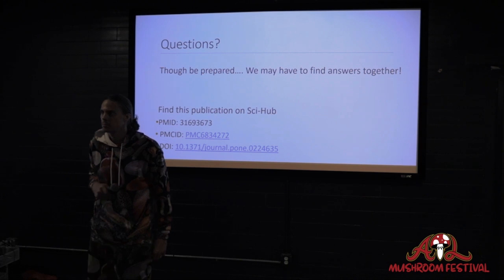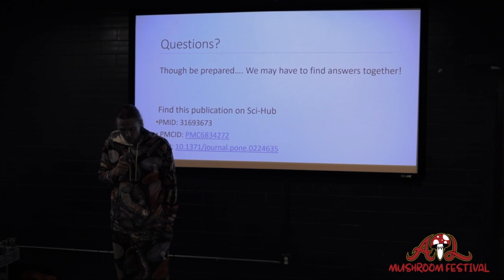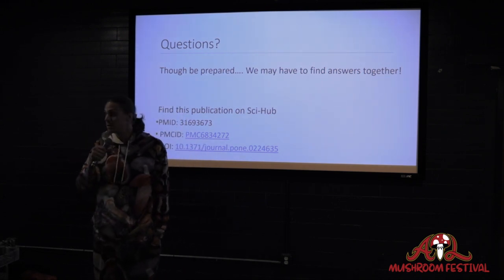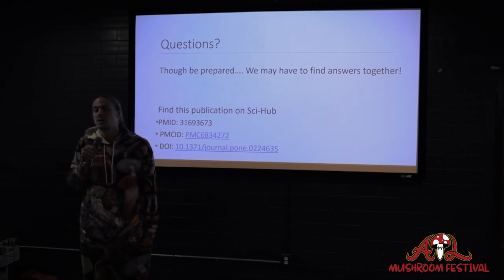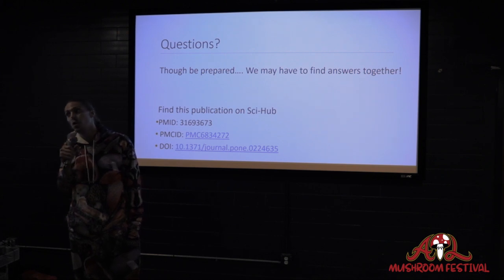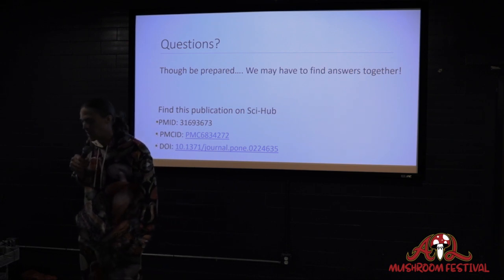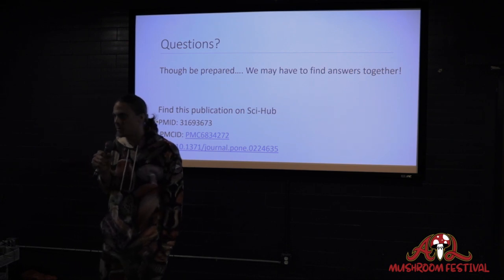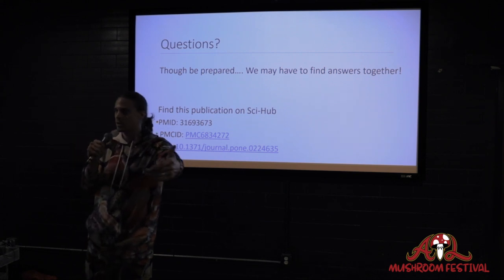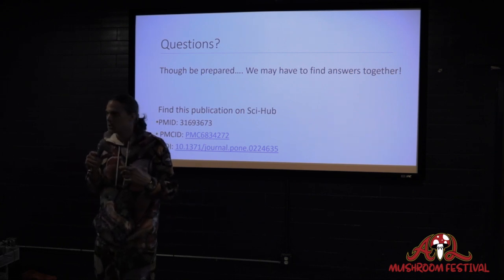Great. Size of roof overlap. What's the best size roof overlap? So it's up to your discretion. You can go as big as you want or as small as you want. I would say that bigger tends to be better, but bigger also means that it's going to take longer to grow through. So time would be the only factor in that essence, except if it's too small. If it's too small, your probability of carrying that contamination forward is significantly higher. And so there is an appropriate roof to size ratio.